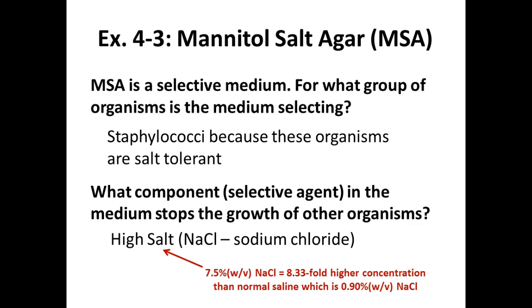So for your organisms, because we're not just looking at clinical specimens, right, stuff that you would get from a person, some of the organisms you guys are working with would come from soil and things like that wouldn't commonly necessarily contaminate somebody's wound or something like that. So if your organism grew on this plate, you know that it's salt tolerant, right? That's what we know about it. And we can assume it may be a Staphylococci.